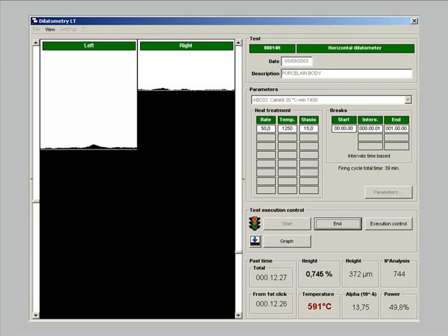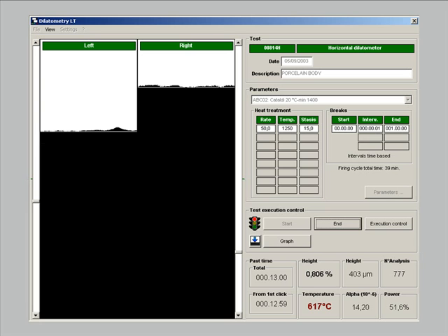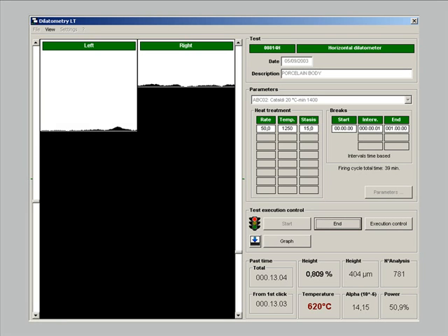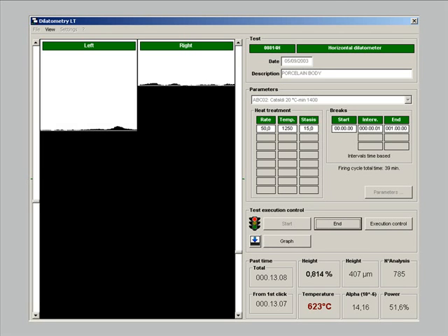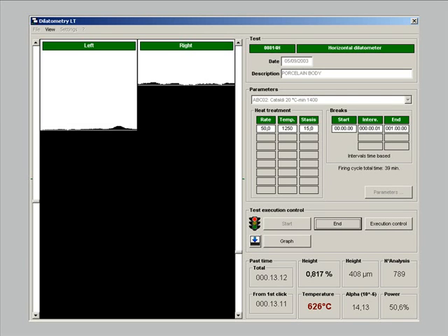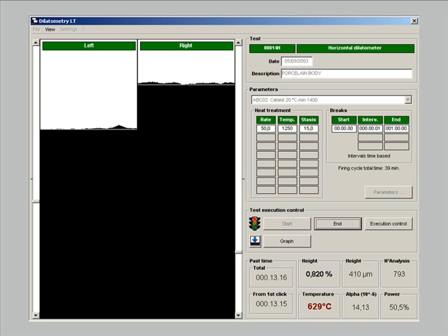A little difference in the friction on the holding rods or on one side of the alumina plate may cause an asymmetric movement on the sample. For this reason, both the optical paths are equipped with linear translators which move the optic in order to keep always the sample ends within the measuring window.